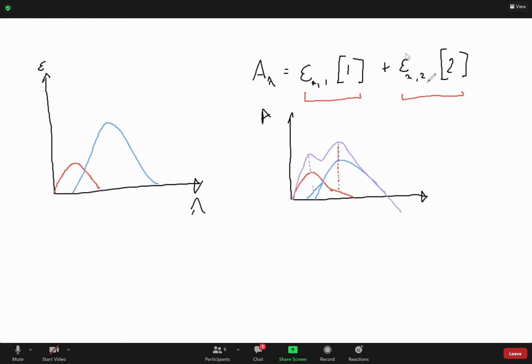It's very well known. So normally you'll get peaks of arbitrary height. In fact, most of your data doesn't have distinct peaks at all. Because the butanol has higher extinction coefficient, it tends to dominate the spectrum, and then the ethanol is just a little bit added on. You normally end up with a butanol-like spectrum with an extended bit at lower wavelength.